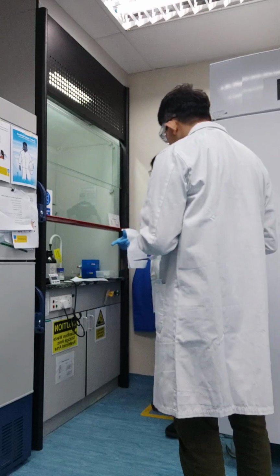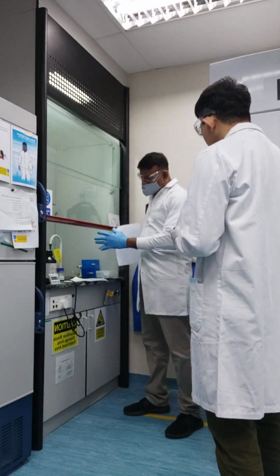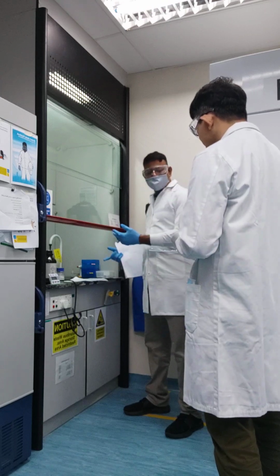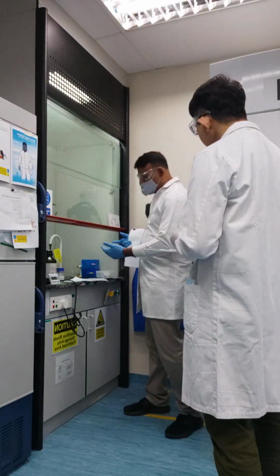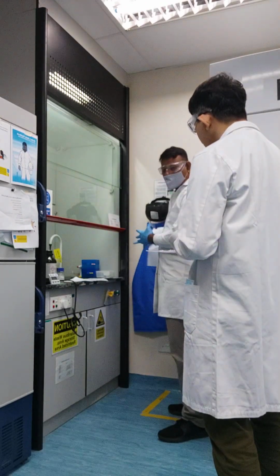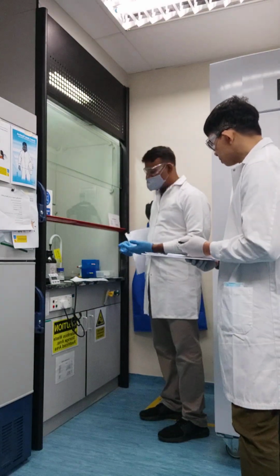Before we start this session, I have prepared all the equipment and materials for you, and I have also prepared 2 sets of personal protective equipment for us before we conduct this handling of the chemicals.